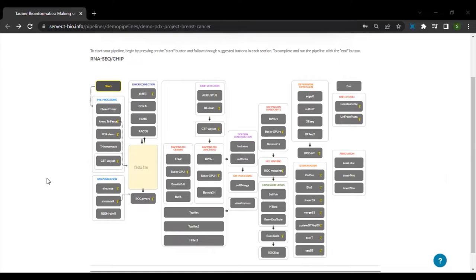Our aim here is to generate gene expression tables from the raw RNA-seq runs. Now, let us click on start to begin the pipeline.